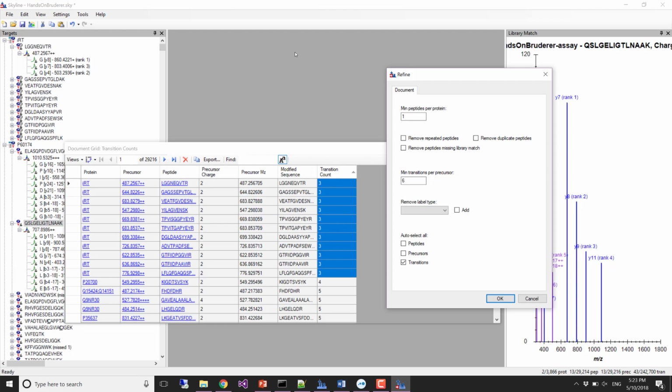All right. Well, just hit enter, I guess. That's really unfortunate. Some of these higher res monitors definitely have had some problems with scaling and things disappearing, but sorry about that. Okay, so is everybody ready to click OK or press enter? If you don't have buttons, enter is OK and escape is cancel. We hopefully have that working in most places.